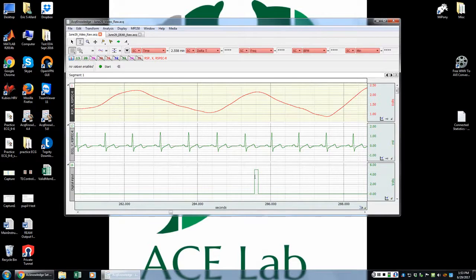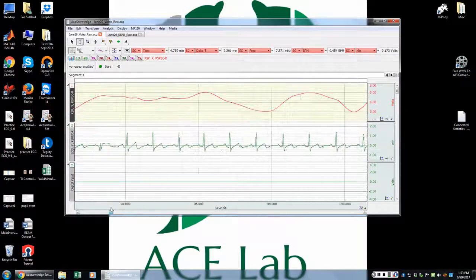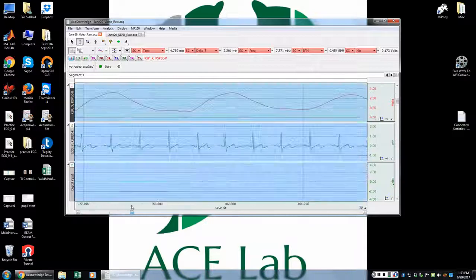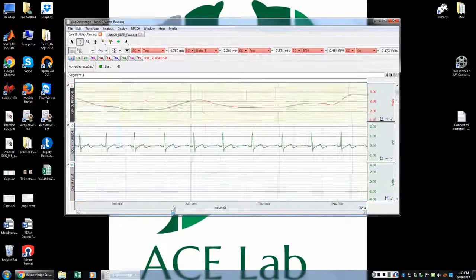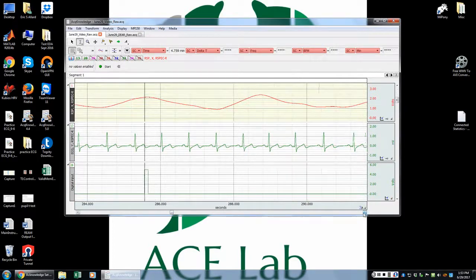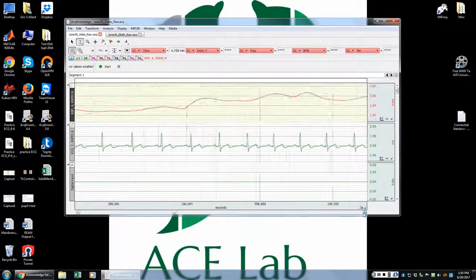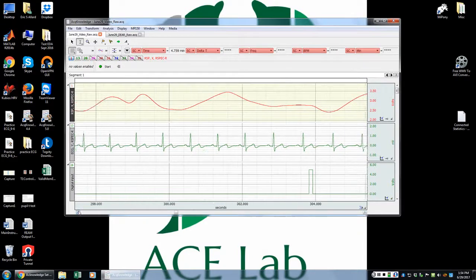I'm going to click on the Shift button on the keyboard and then left click. Okay, so it's a little bit off there. Oh, I know what happened. Okay, actually, I know what happened with this one here.